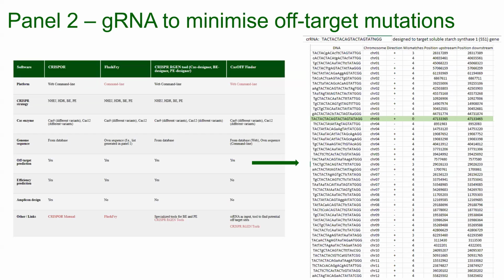So you can see for our one guide indicated in green that for this specific guide RNA, we can distinguish some off-target sequences. So it's important to know that for this specific guide, for instance, we have a lot of off-targets. For other guides, the situation was much better, with not so many off-target mutations, or even for some guides, we didn't find off-target sites. So by these programs, you can figure out how specific your guide RNA is. We give all the instructions and parameters to do so.